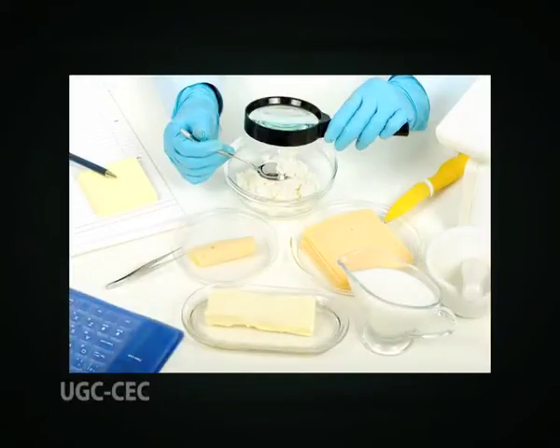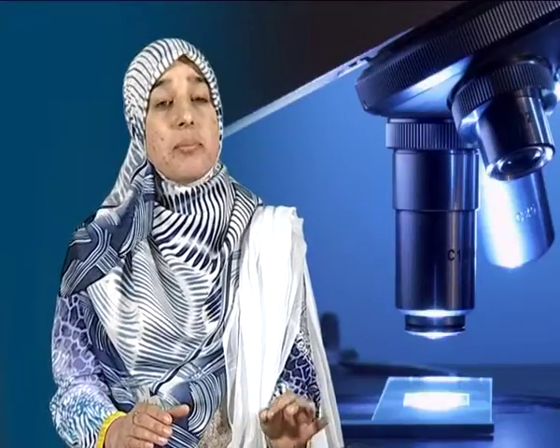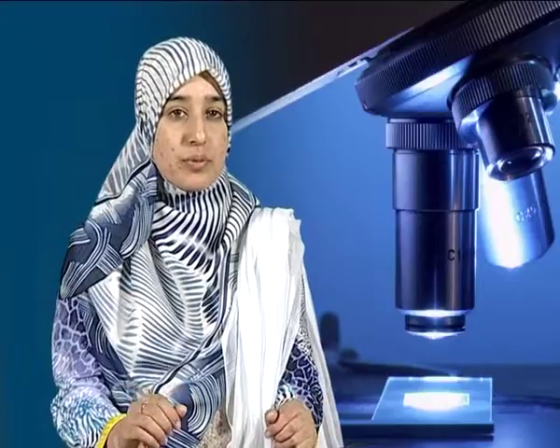DMCs are most widely used in the dairy industry for assessing the microbial quality of raw milk and other dairy products, and the specific method employed is that originally developed by R.S. Breed. Briefly, the method consists of adding 0.01 ml of sample to a 1 square centimeter area on a microscope slide and, following fixing, defatting of the sample and staining, the organisms or clumps of organisms are enumerated. The method lends itself to the rapid microbiological examination of other food products such as dried and frozen foods.